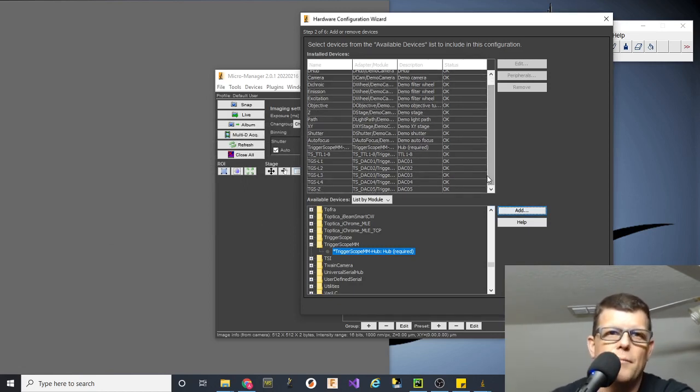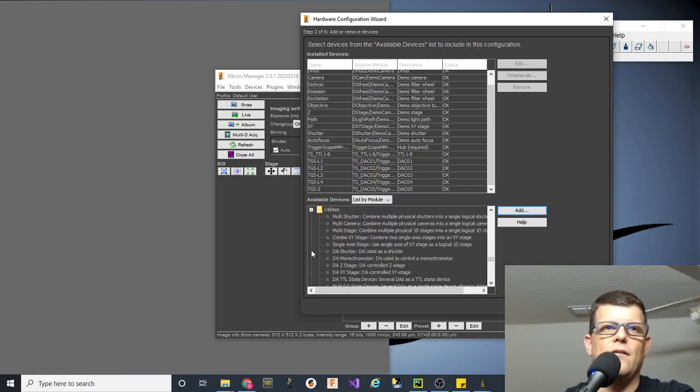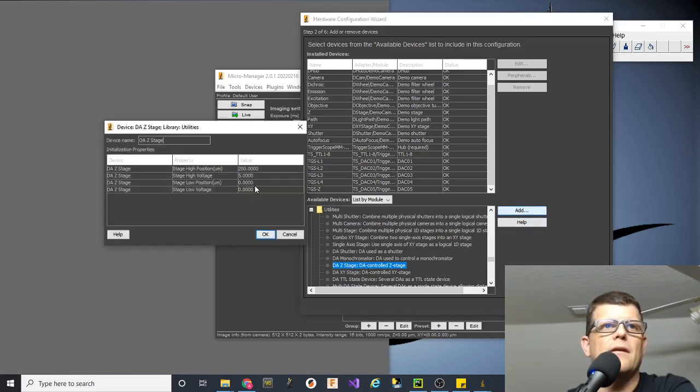That's cool, but there's a couple other things we have to do. The first thing I'm going to do is go to the Utilities menu. And these utilities will work on any device. So we've already got the logical object built, but what we need to do now is assign, for instance, Z. I'm going to tell it, hey, I have a digital to analog output, and I want to set it up so that MicroManager sees it as a stage. So we'll add that. Here it's asking me for a low and high voltage, so we're going to put in low voltage 0, low position might be, you know, -250. High voltage will be 10.